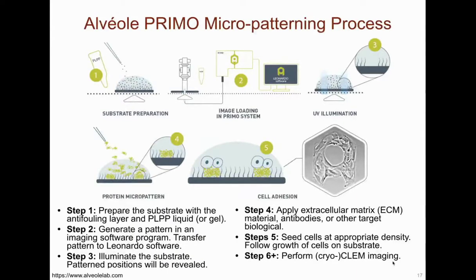image creation software. The pattern can be simply a regular pattern of ordered lines to complex patterns that include multiple geometries and possibly gradients within the pattern. The pattern is then transferred to the Leonardo software that will control the substrate patterning process on the microscope.